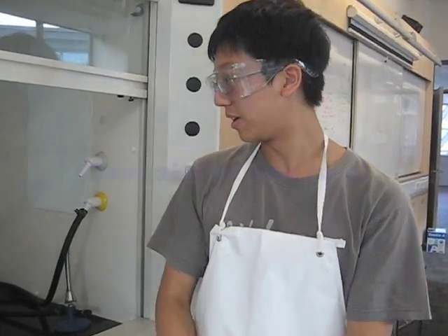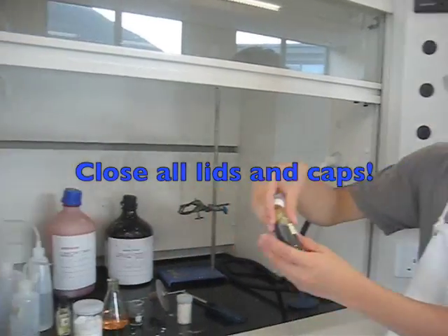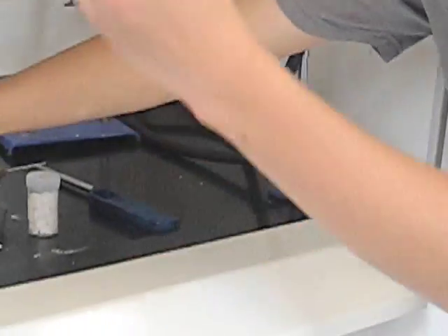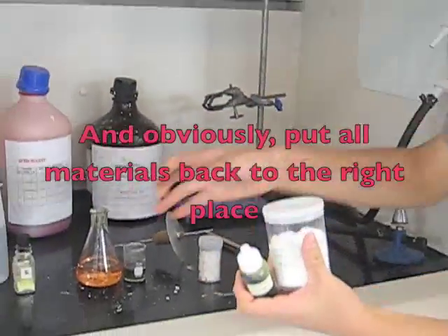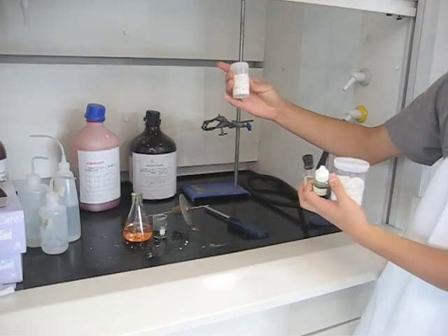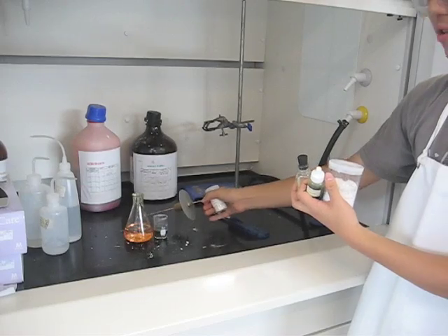Now it's time for lab cleanup. You need to close all lids, such as the universal indicator lid, and put them back in their proper place — the liquid indicator, baking soda, sulfur, calcium carbonate, and the rod tool.